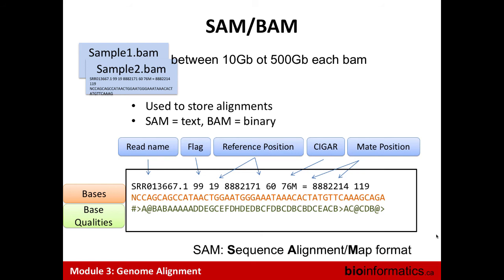What is important to know is that a match for an aligner doesn't mean it's a perfect match. It could be a substitution. So a match means that it's saying that this base corresponds to this region, whatever it is, not necessarily the exact same base.